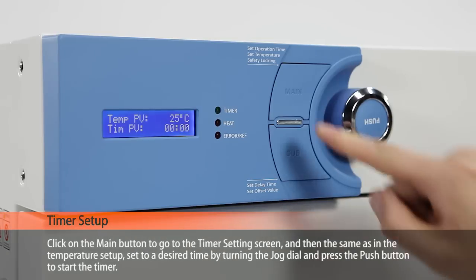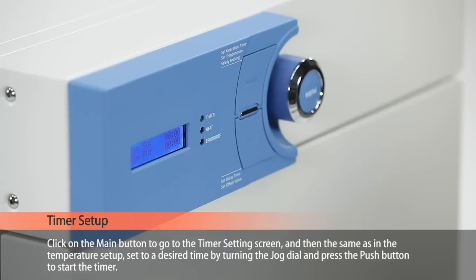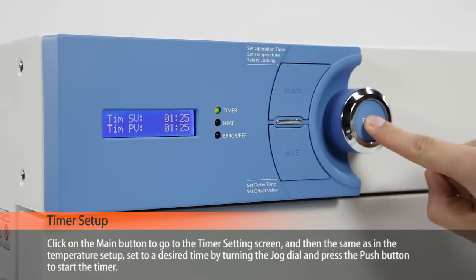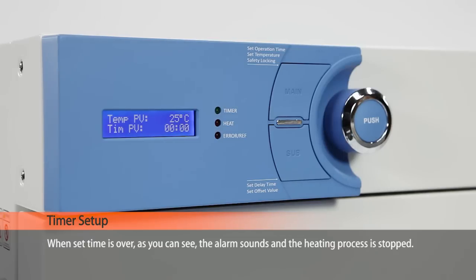Click on the main button to go to the timer setting screen. Then, the same as in the temperature setup, set to a desired time by turning the jog dial and press the push button to start the timer. When the set time is over, the alarm sounds and the heating process is stopped.